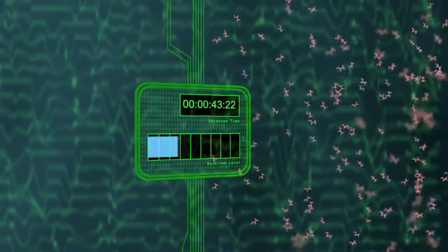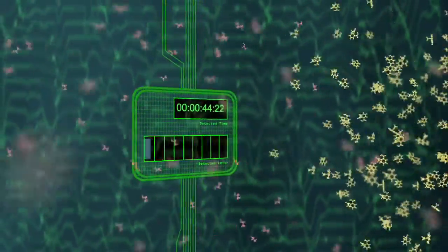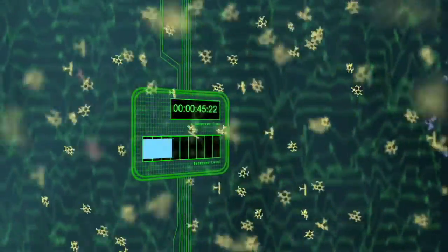Just before each compound exits the instrument, it passes through a detector that records the time and relative quantity of each substance.